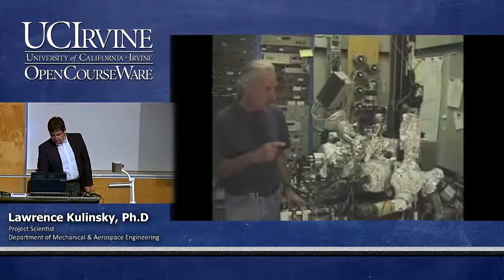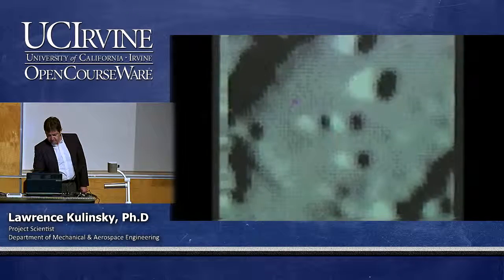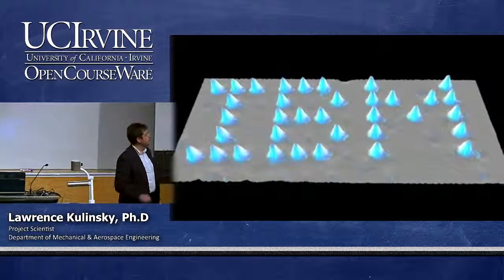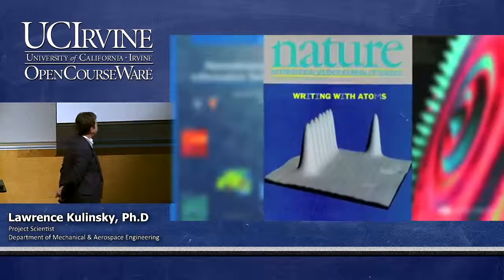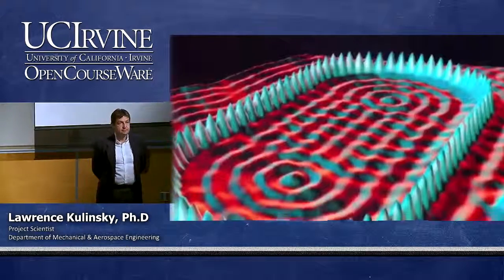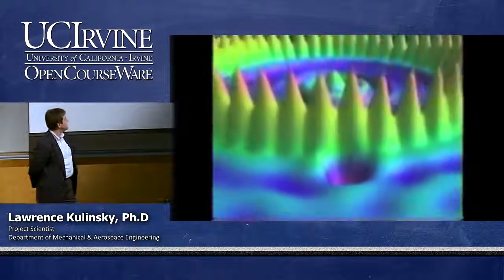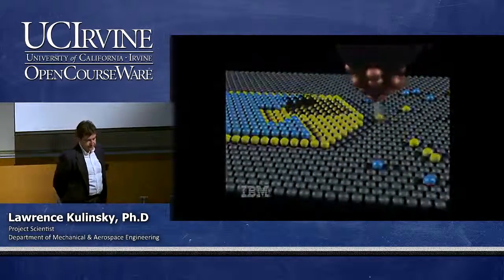Dr. Eigler built his scanning tunneling microscope in order to visualize and experiment with individual atoms and molecules. As he experimented, he discovered that it was possible to slide individual atoms and move them using the tip of his microscope. To demonstrate this ability, he created the world's tiniest IBM logo, made from 35 xenon atoms. Dr. Eigler's accomplishment remains, to this day, one of the most important breakthroughs in nanotechnology. At the time, the implications of this achievement were so far-reaching, they almost seemed like science fiction. But now, 20 years later, it's clear that this was a defining moment that has spawned the kind of research that will eventually bring us beyond anything ever imagined.